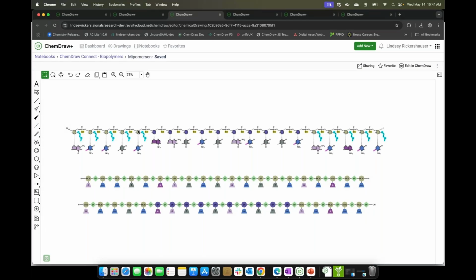Okay, so that's a little bit more complex oligonucleotide, but it doesn't stop there, right? We still have other kinds of biopolymers that we want to register. So I've shown you 2 more simple biopolymers, and as Nika alluded to, the top of that triangle are very complex biopolymers.